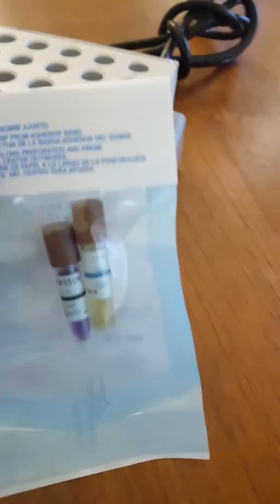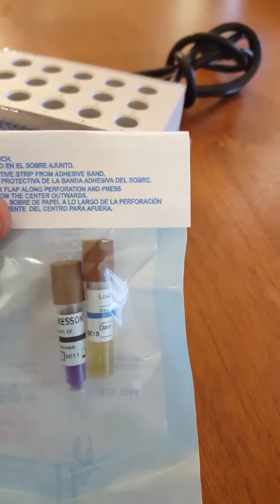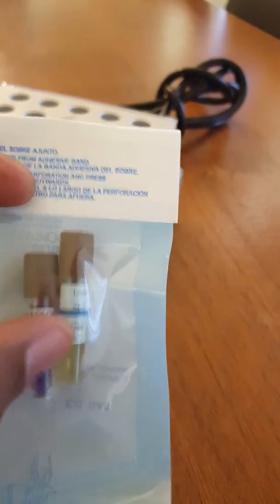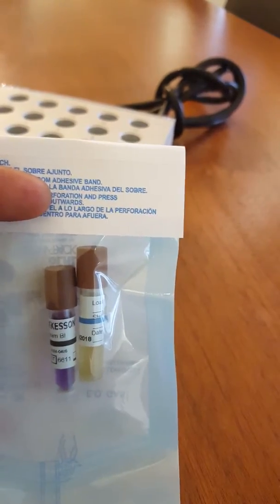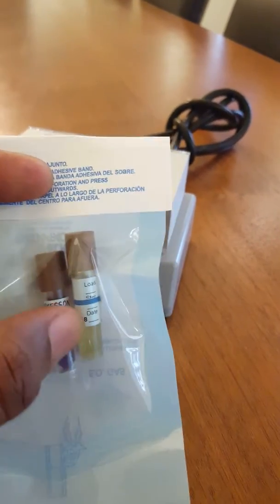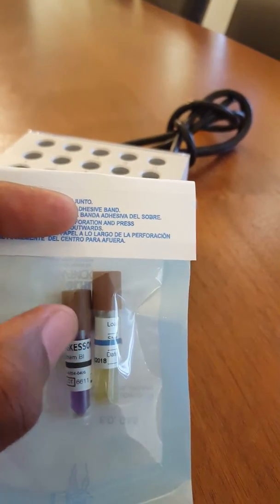So the last thing that you want to do, just to confirm that you can actually throw these away in regular trash, is place them back in a bag and autoclave them one more time. The reason we're doing that is that the one that does show active for spores, we want to kill the spores that are within this little chamber, and then you can throw it away. So again, it's very important after you've confirmed that it shows a presence of spores, we have to autoclave it one more time, and then you can throw it away.